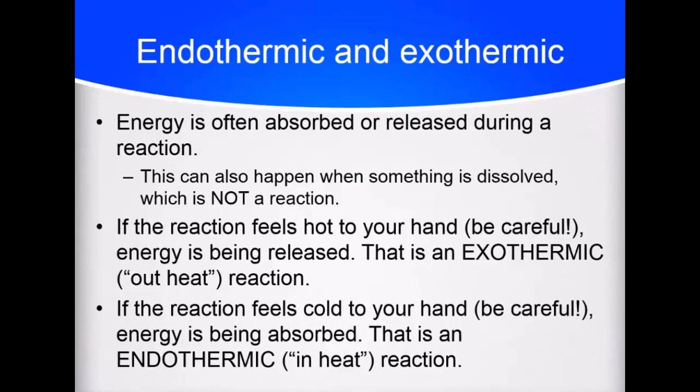So energy is often absorbed or released during a reaction. Could be when something was just being dissolved, physical change rather than an actual chemical reaction. But regardless, it can be evidence of a reaction occurring. So we want to feel our reactions carefully, of course, to see if it feels hot, the energy being released from the reaction into your hand, or feels cold, the reaction absorbing heat from your hand.